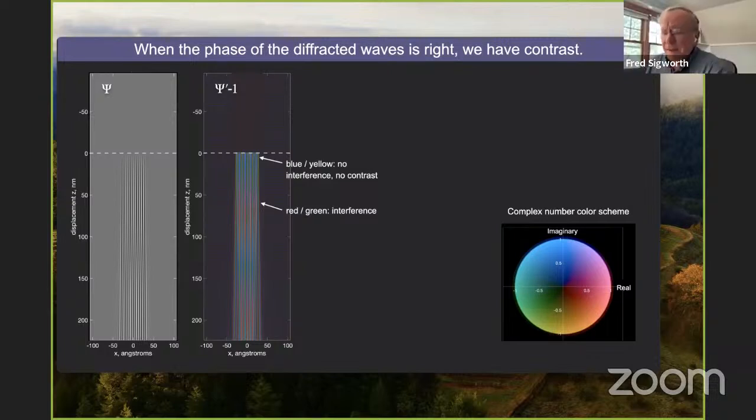Well, we have the same problem with light microscopes. It's just that light microscopes have nice phase contrast devices. They have phase plates and they have Nomarski interference optics and so on. So they've solved the phase contrast problem by having the right kind of optical components.